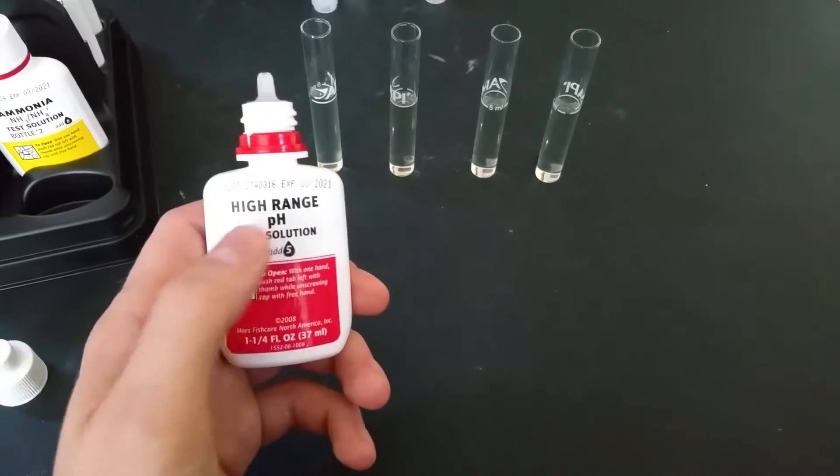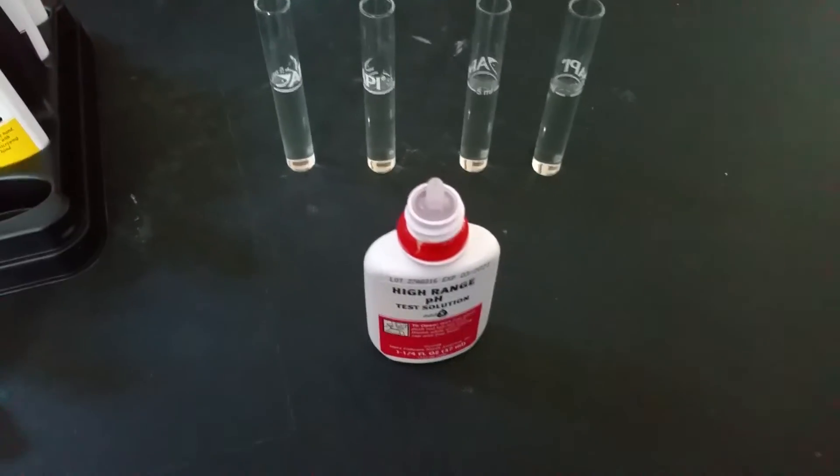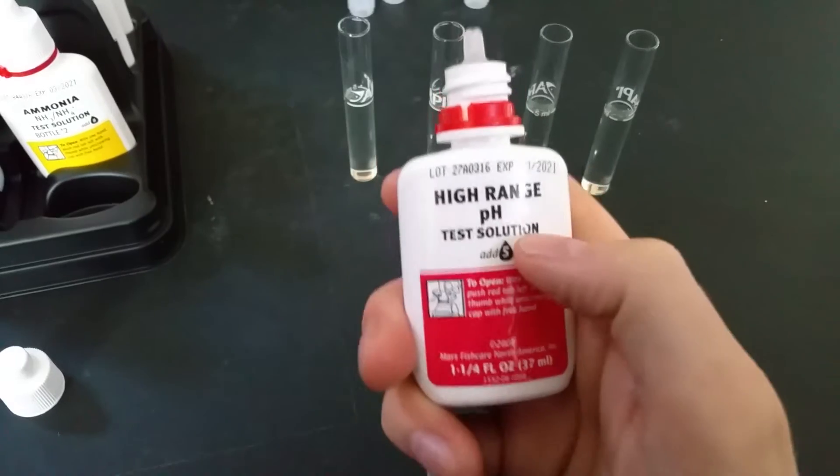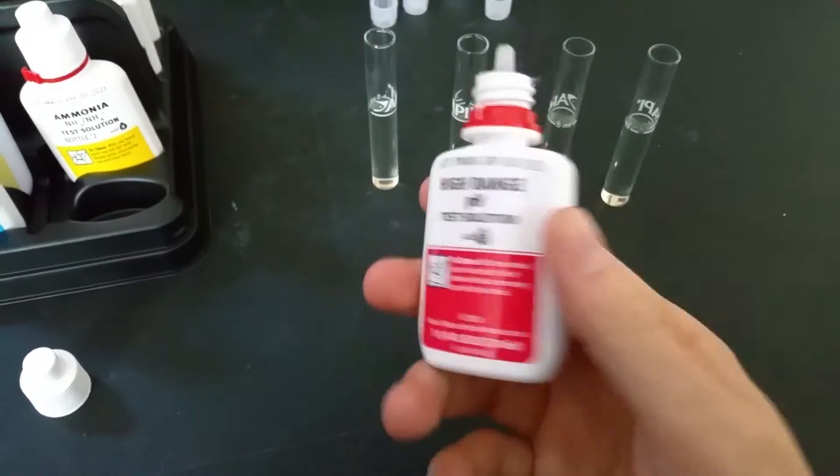So I would recommend doing high range pH first before doing normal pH, and then doing your ammonia, nitrite, and nitrate all at the same time. Then if this does not seem accurate, use the normal pH. In my experience, most people will have more high range pH than non-high range pH.